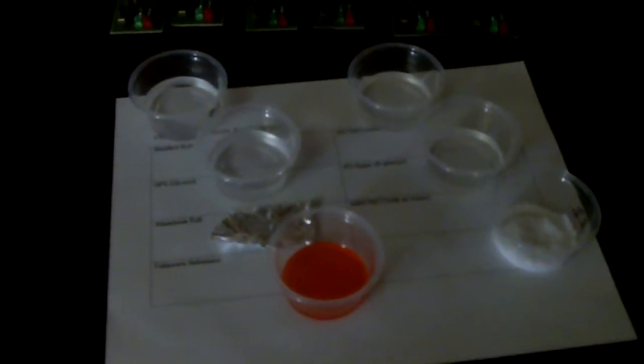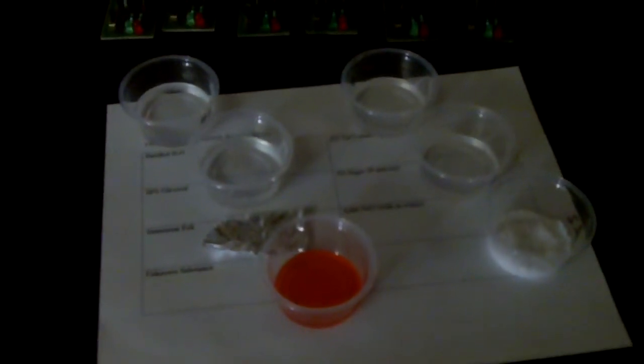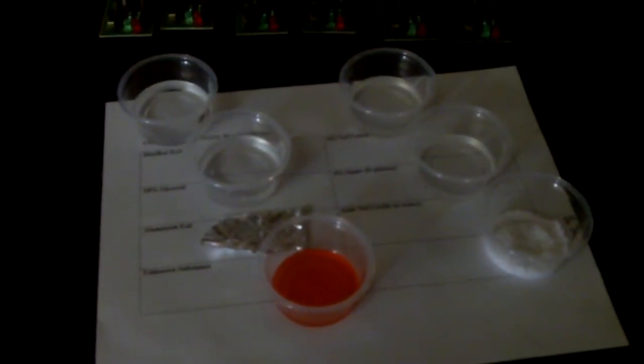Hello, this is the lab makeup for Unit 4, Conductivity Tests. Ionic compounds are formed when oppositely charged particles attract one another. A good example of an ionic compound is sodium chloride.